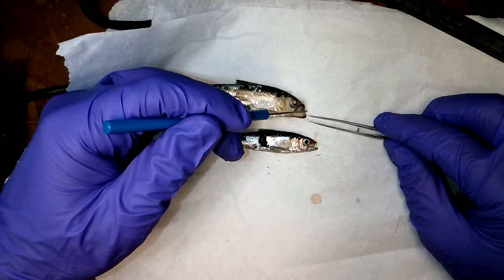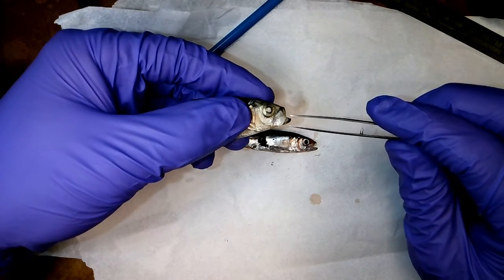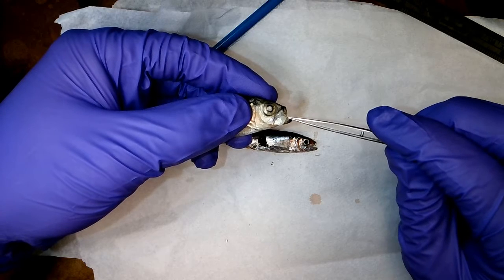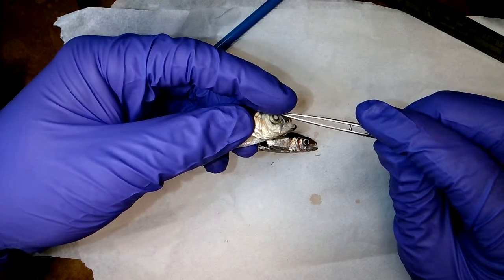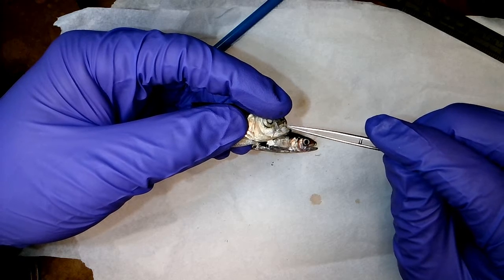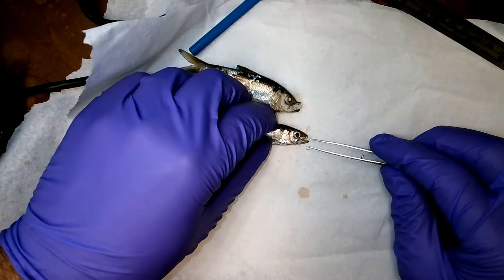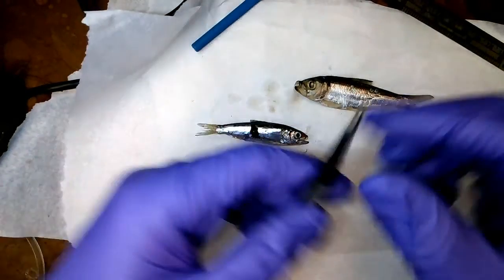Okay, and when extended, try not to butcher this here. When opened, you can see that this jaw shapes down. Let's move this out of the way. Right here. Very subtle. Trends down. Okay? So hopefully you can see that in your specimen.